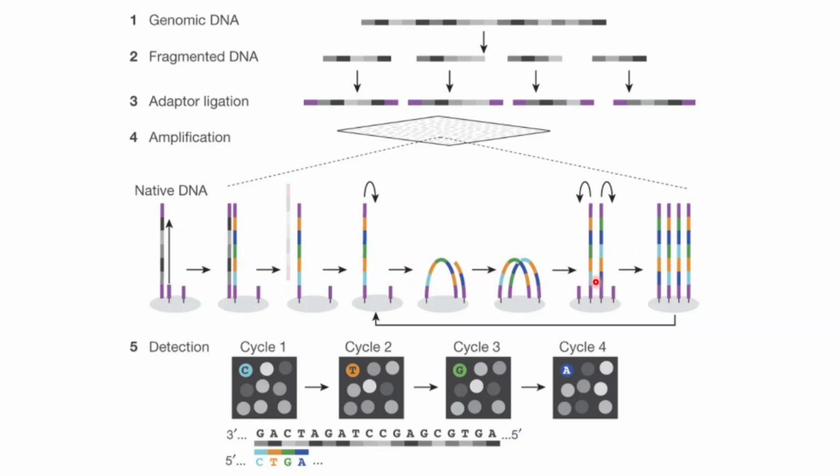And based on this, another extension is also formed there. The other reads are also formed there. Then these adapters can be removed in this case. And then another type of sequencing can be done in this case. So this leads to the formation of what is called a cluster, because several of the reads are formed within each flow cell, right. So it actually forms what is called a cluster. So this is called a cluster.